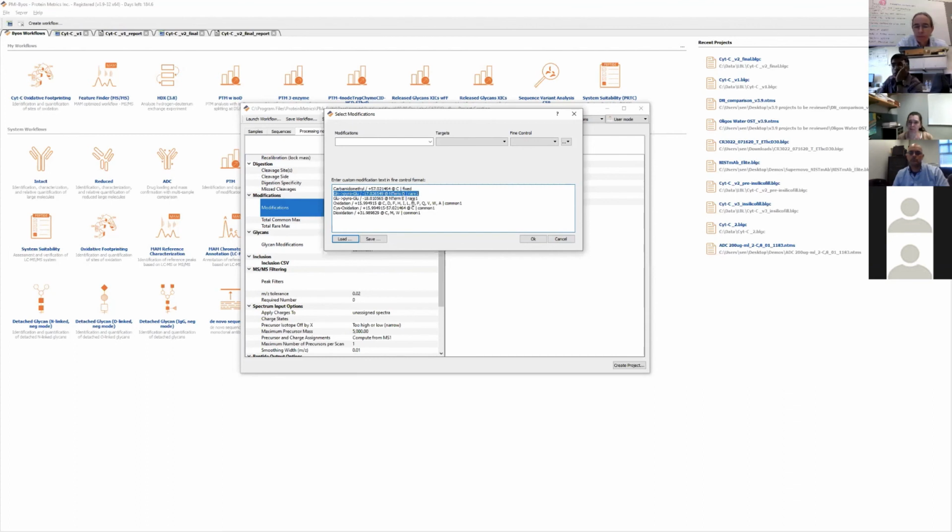So we want to make sure peptides identified with N-term pyroQ can also have an oxidation. So that combination is allowed. But we're not going to be identifying, for example, in this case, a dioxidation and an oxidation at the same time. We're going to be identifying one or the other on a peptide. Right, so those are typical modifications here, nothing groundbreaking.